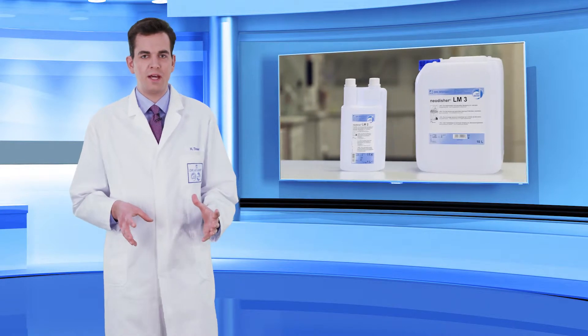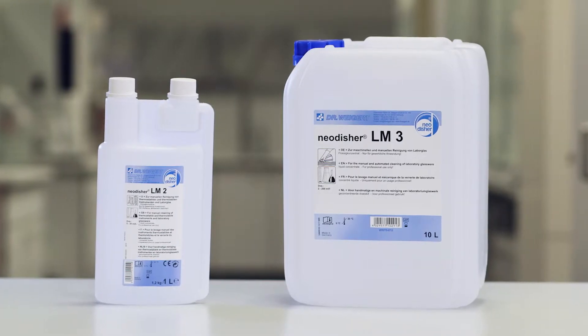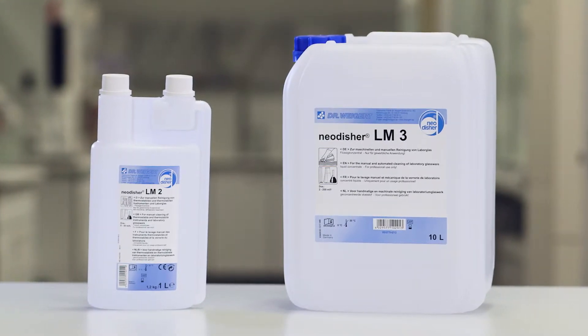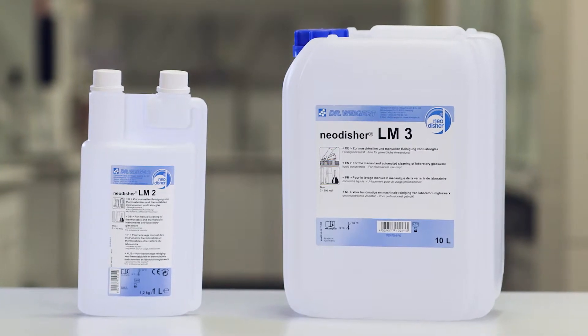Mildly alkaline cleaners have proven themselves effective in preventing glass corrosion. For manual reprocessing, Dr. Weiger recommends Neodischer LM2, and for automated reprocessing, Neodischer LM3.